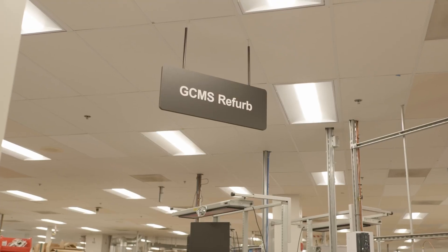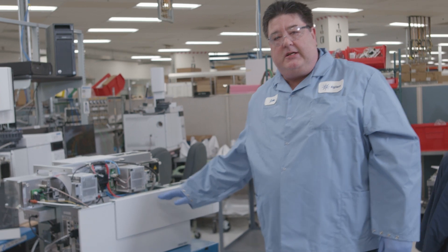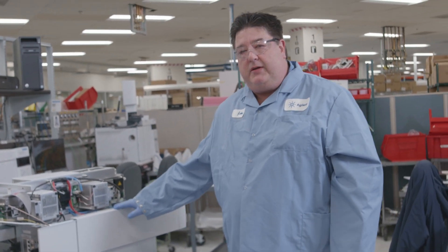Here I have an instrument that I'm about to work on. It's a GC triple quad mass spec with extractor source.